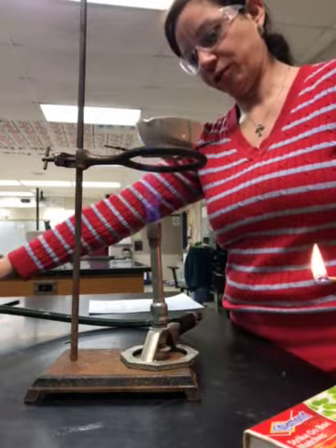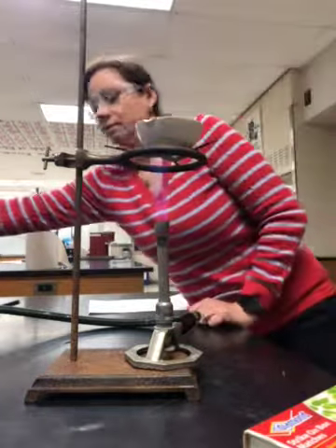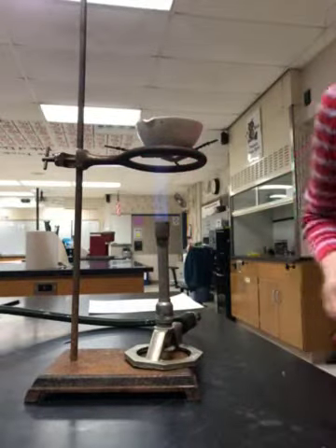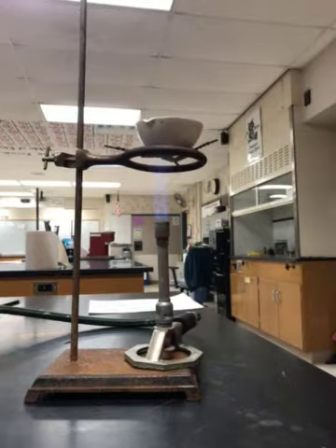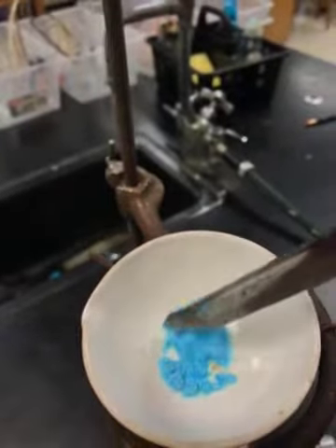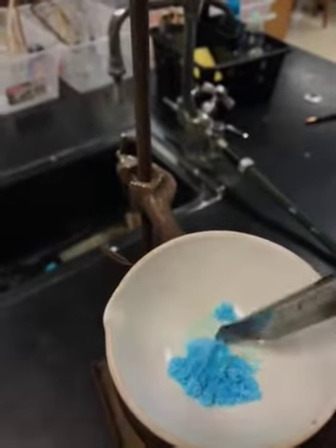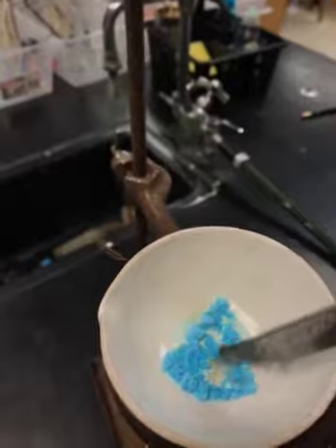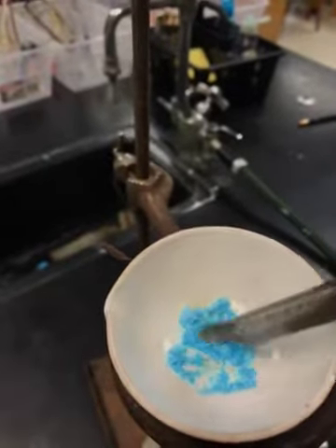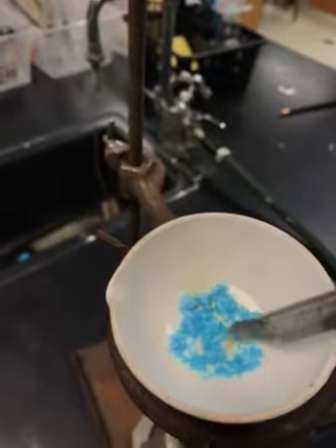And you can adjust your flame. You want to heat it kind of vigorously, and we need to heat it for about 5 minutes or so. And go ahead and break up some of these clumps. And the cool thing about copper sulfate is that when it's in the anhydrous form, when it doesn't have any water, it's actually kind of a whitish, grayish color.